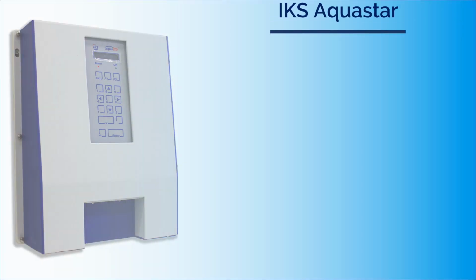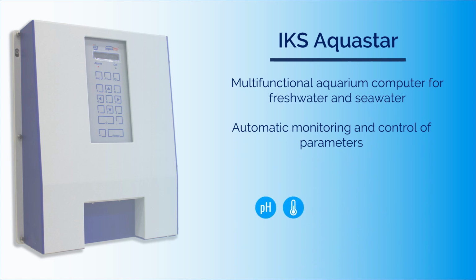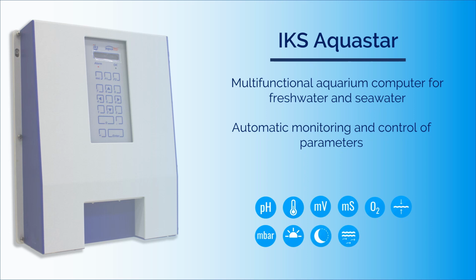The IKS Aquastar is a multifunctional aquarium computer that is capable of automatic monitoring and control of different water and lighting parameters both for freshwater and seawater. It has an array of functions which includes the measurement and control of pH, temperature, redox, conductivity, oxygen, and water level. Also, it can measure air pressure, simulate day and night, different lunar phase, current, interval timing, and save data log into a computer. The IKS Aquastar operates under the principle of switch hysteresis.